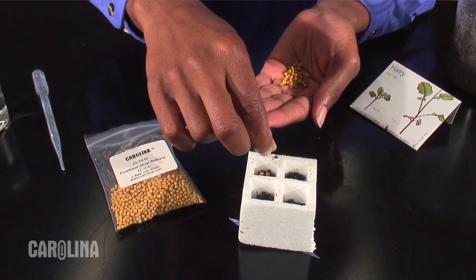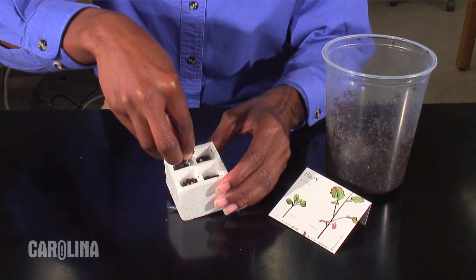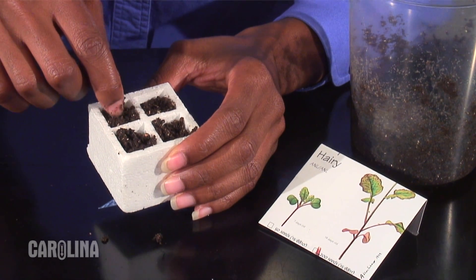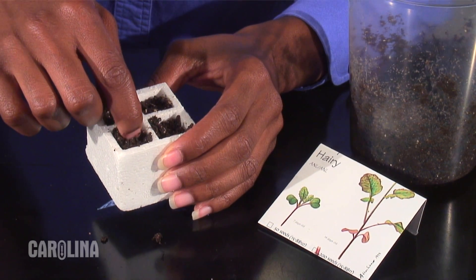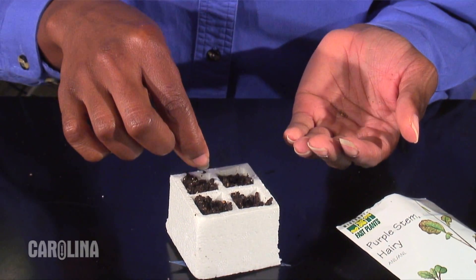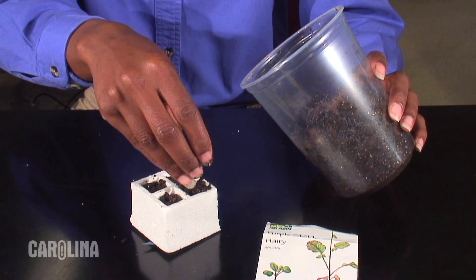Drop in three fertilizer pellets. Finish filling each chamber. Use the ball of your finger to make a slight depression to receive the seed. Drop two fast plant seeds into each depression.